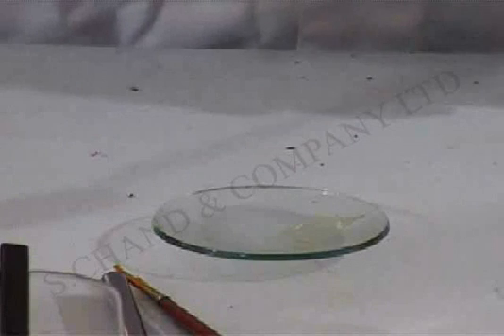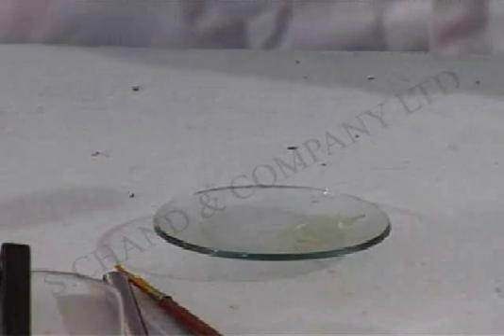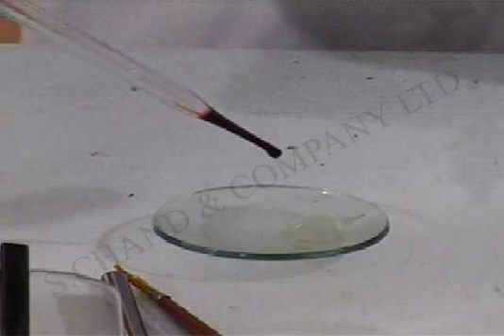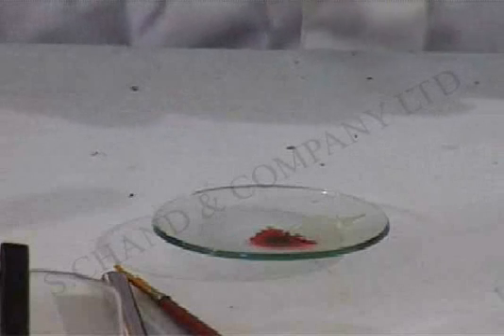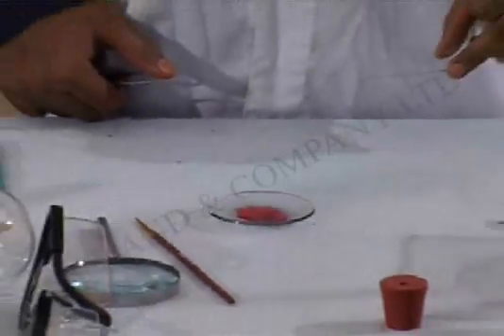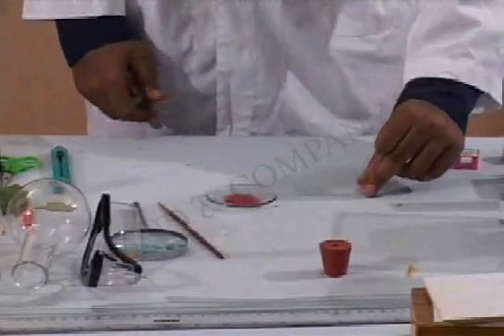You will need to stain this leaf for clear visibility of the stomata, which you are going to do right now. What you see in the watch glass now is a safranine solution which is mixed with water. What is now visible to you is the peel which is sufficiently stained in safranine. We will now make it on this slide.